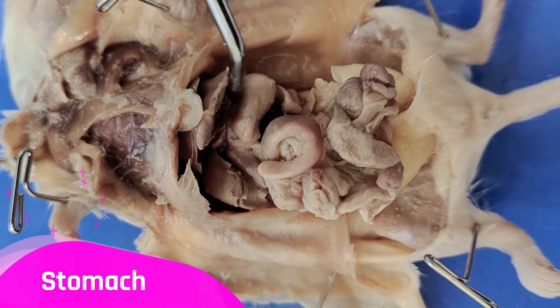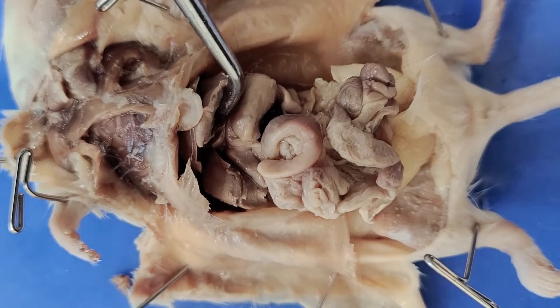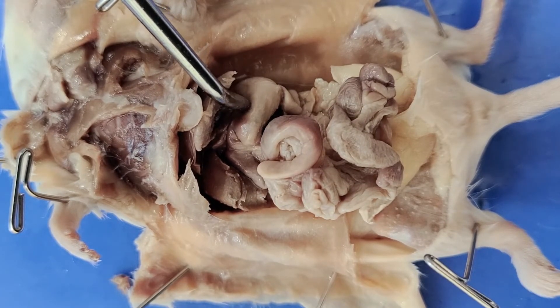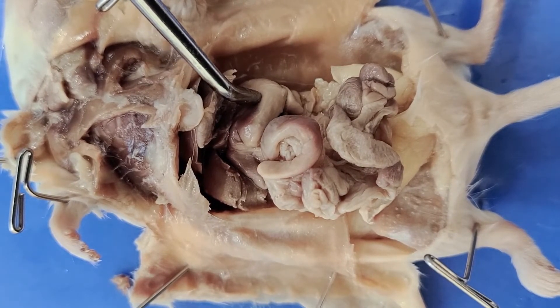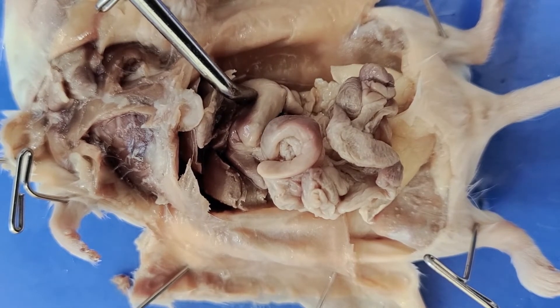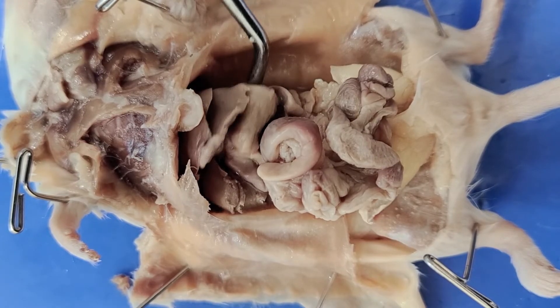Below the liver is the stomach, which is this pouch-like structure right here. The stomach is where food begins to be broken down by chemical digestion, as the stomach releases digestive enzymes and acids. The stomach is also the site of mechanical digestion — it contracts to break up food particles.